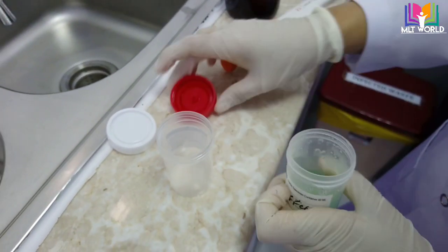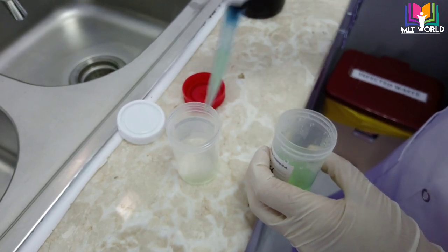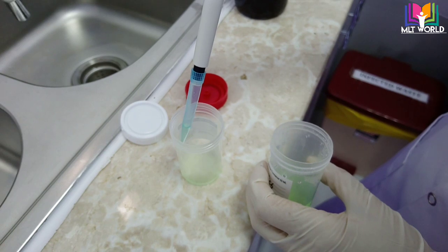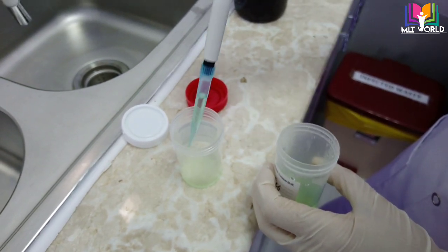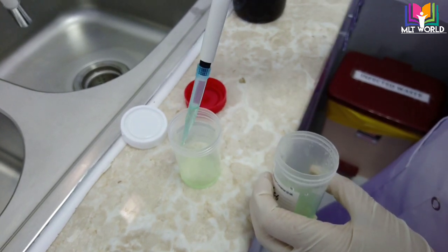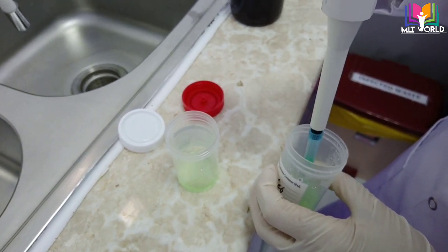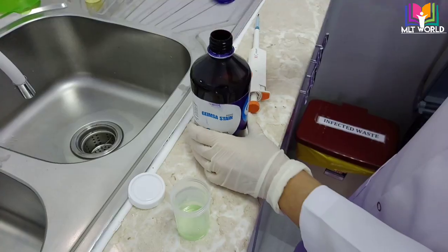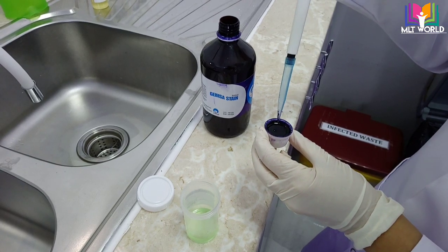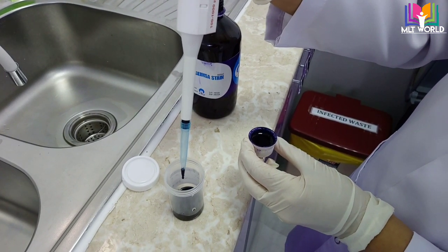After that we will stain. In that time period we will make our buffer. I will use a 1-to-9 dilution to prepare 10 ml of stain. I take a sterile container and add 9 ml of buffer. If buffer is not available, you can use distilled water, but always prefer to use buffer because the stain will come out more properly — otherwise contamination or crystallization can appear in the smear, especially for RBC morphology, making it difficult to read. Now we will take 1 ml of Giemsa stain, add it to the 9 ml buffer, mix it, and our stain is ready to use.